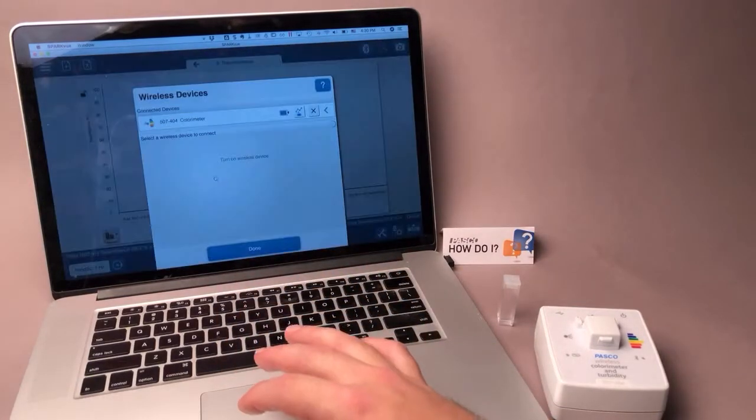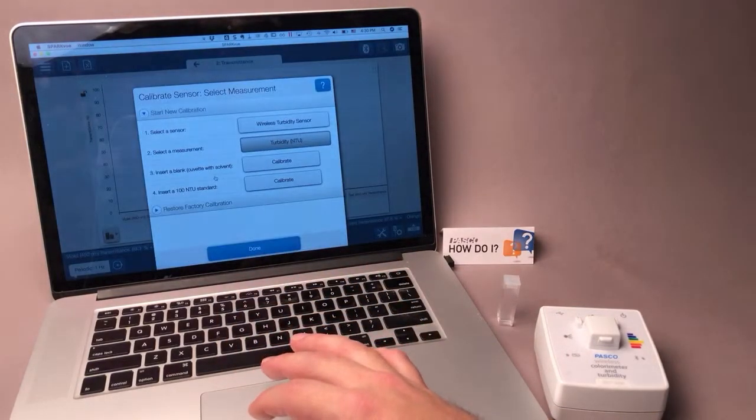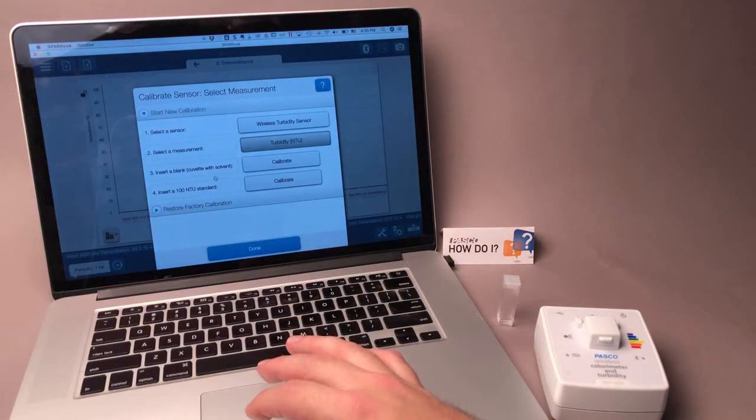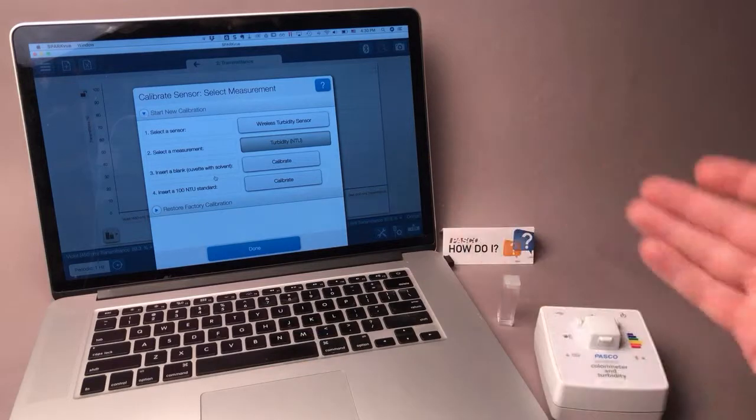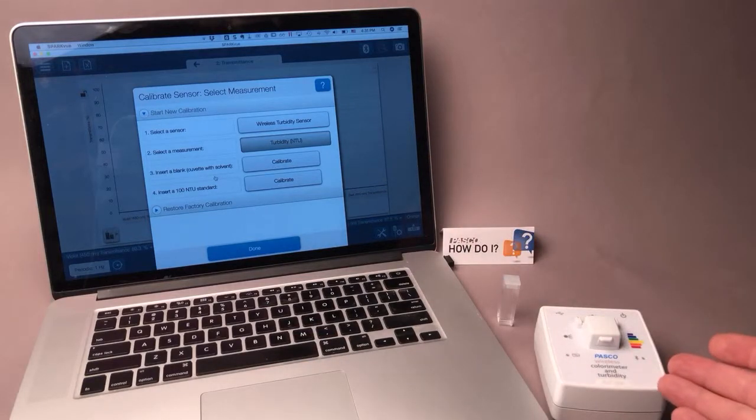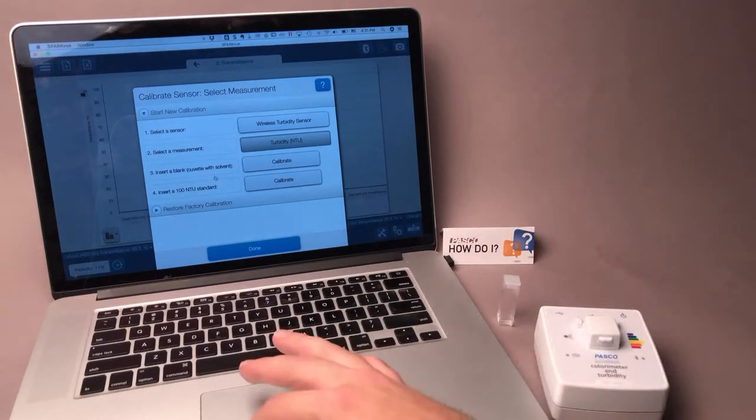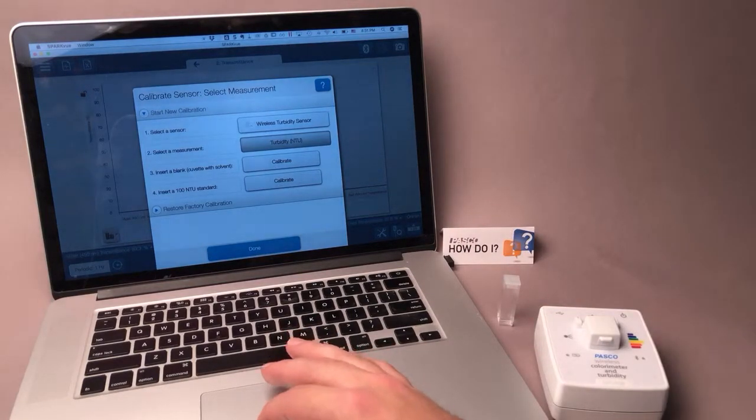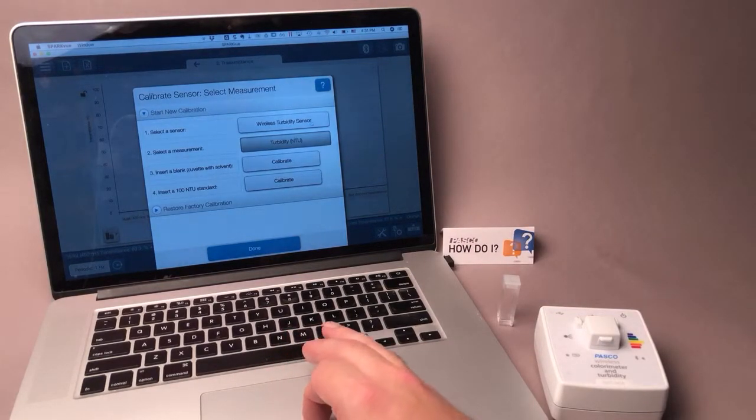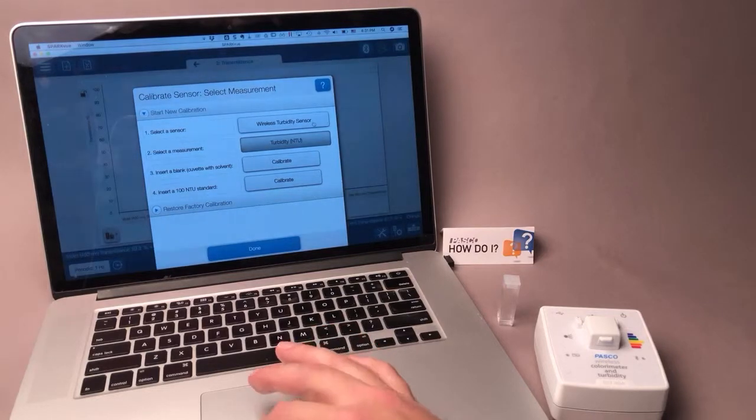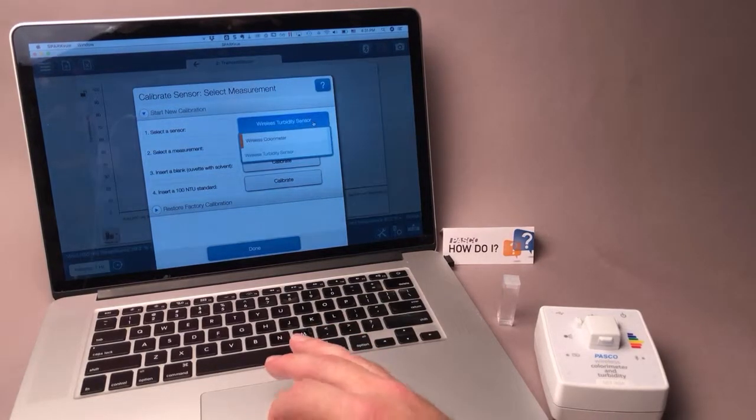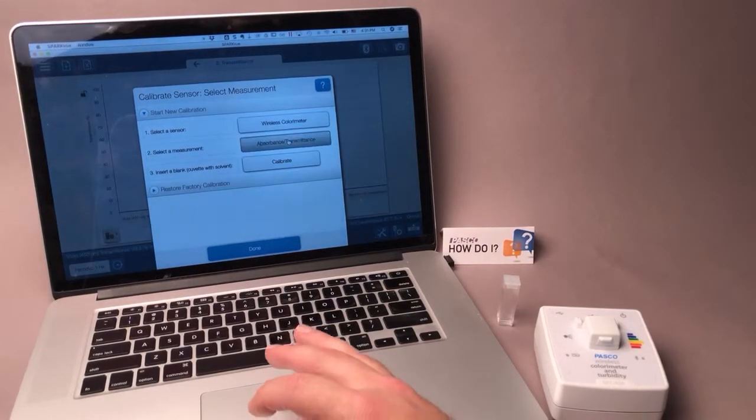I'll choose Calibrate to open the calibration dialog. Since this sensor can measure both colorimeter measurements and turbidity, I'll be sure to select the sensor I want to calibrate. In this case, I'll switch from turbidity to colorimeter.